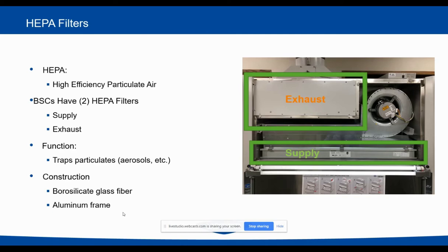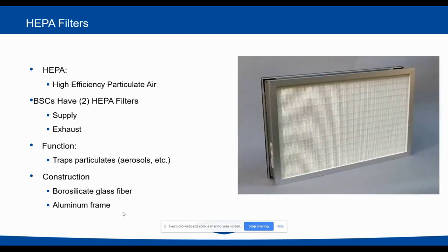And also, if you happen to want to do a deep cleaning on the biosafety cabinet and you remove the diffuser on the inside of the BSC, you need to be extremely careful so as not to spray any liquid on the filter or touch the filter either. Here's just a quick shot of what a HEPA filter looks like, and you can see there's lots and lots of ridges here. That's all of the folds, and what those translate into is a significant amount of surface area for particulates to load, giving a biosafety cabinet an extremely long HEPA filter life.